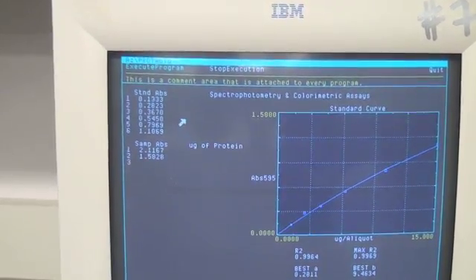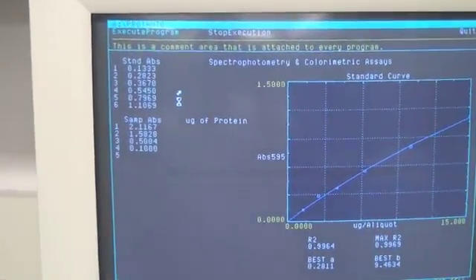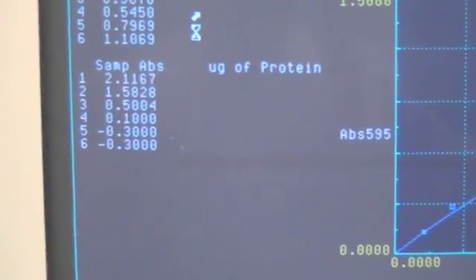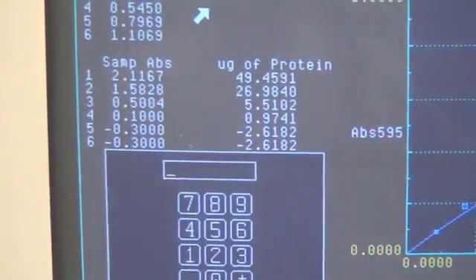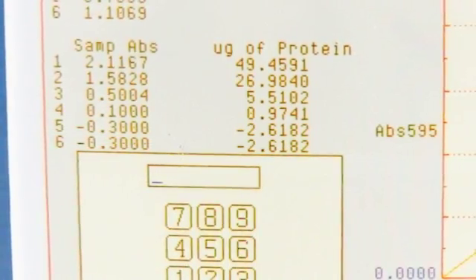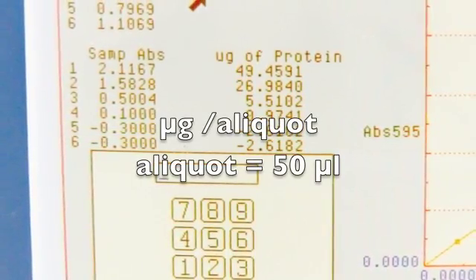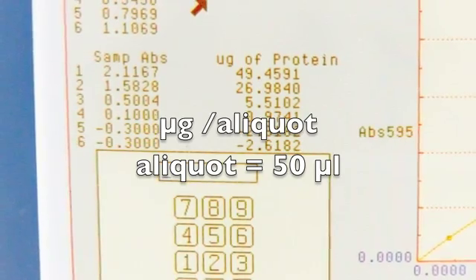The spectrophotometer program will also provide absorbances and determine the corresponding concentrations based on the curve fit tool's results. The concentrations are listed in micrograms of protein to the right of the absorbances, and they are the micrograms per aliquot for each sample added to dye.